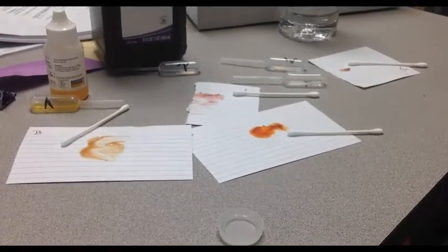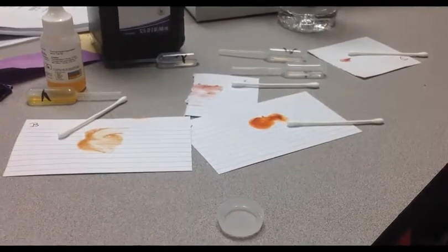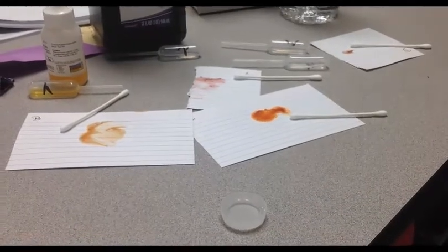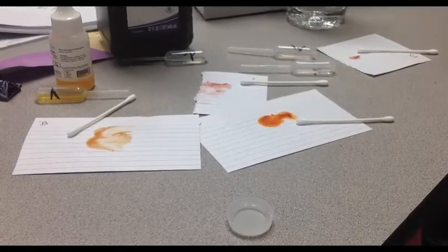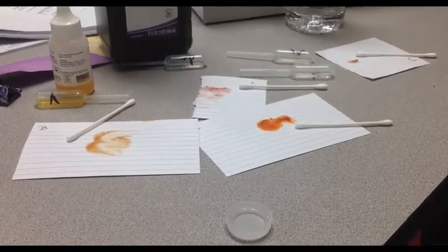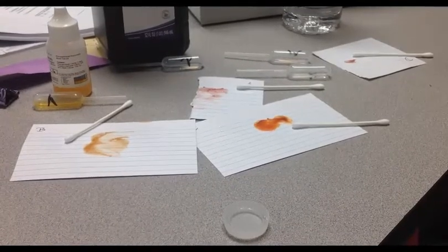In any crime scene, when you come upon it, you have stains everywhere. You don't know if these stains are blood or it could be ketchup for all you know. But there is a simple test that determines if it is blood or not, and it's the Kastle-Meyer Presumptive test. This test will allow you to determine if it is blood or not.